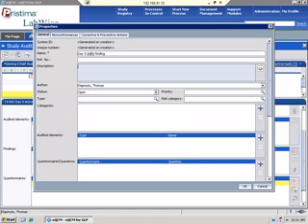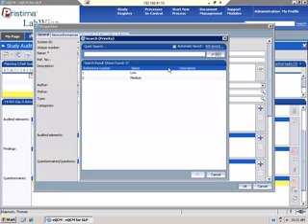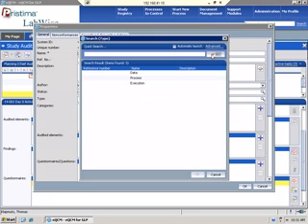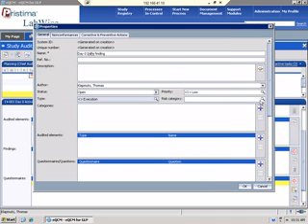You have reference numbers. You can put in a description. Again, the person who's doing the audit's already pre-populated. The status of the finding is going to stay open. And then you can define specific priorities. And again, this is where I was saying you can define the list of items on here. So I have low and medium priority. The type of finding, again, you can define, is it a data, process, execution? So this is an execution during day 0.